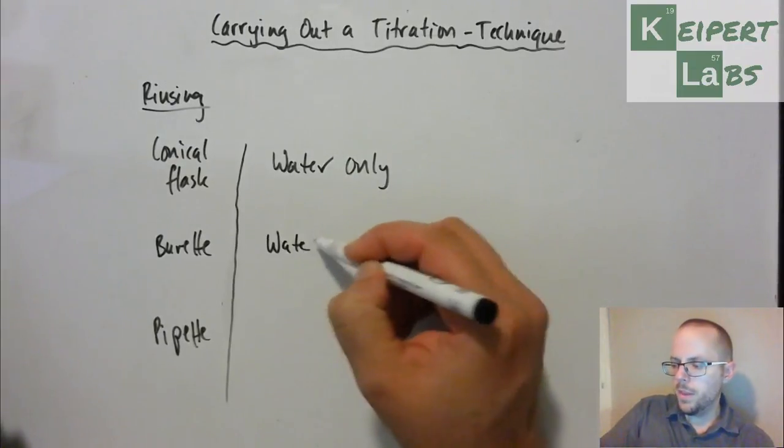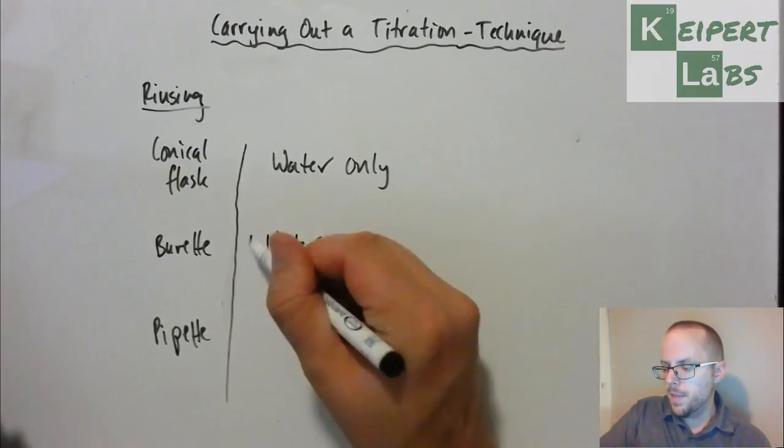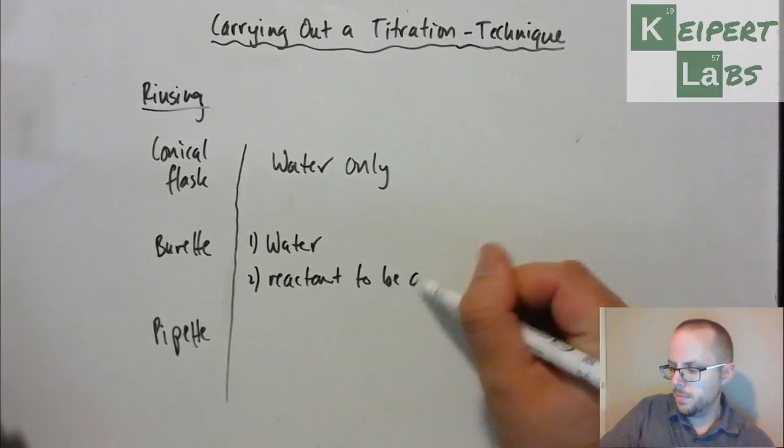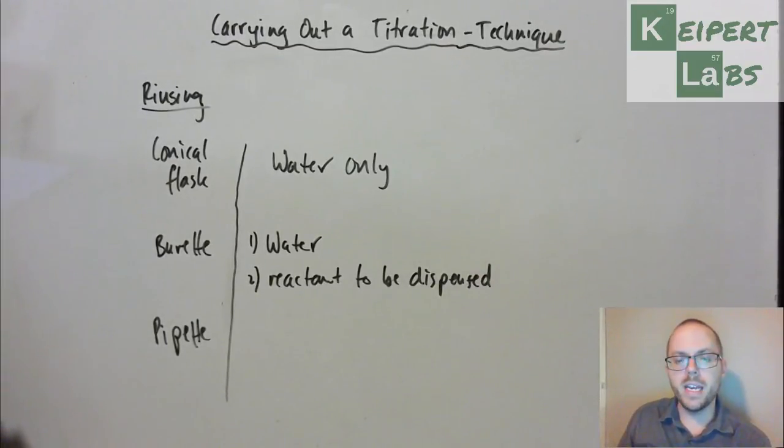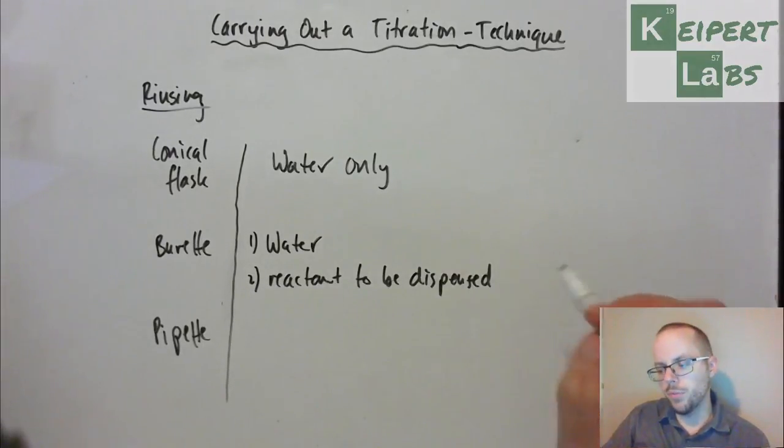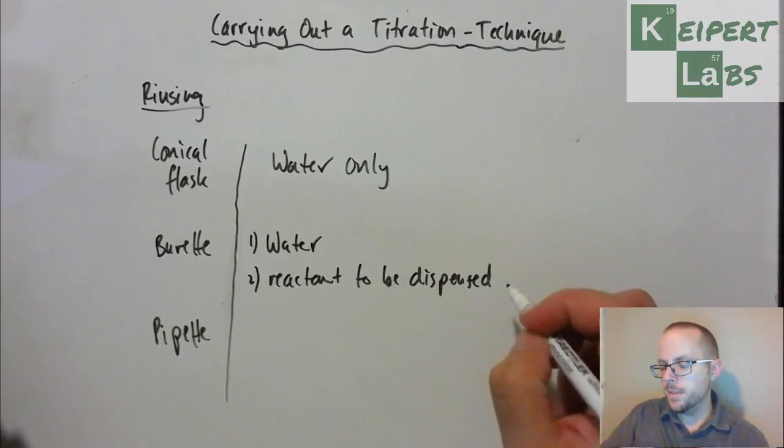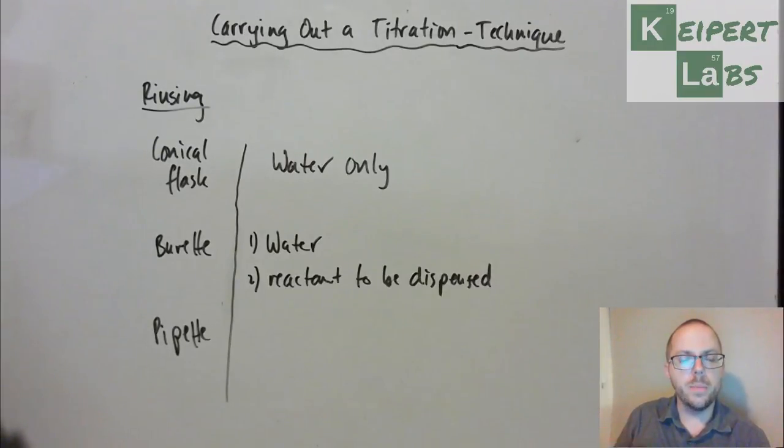So then, with a burette and then also with a pipette, we first rinse with water and then we second rinse with the reactant to be dispensed. So we get a small amount of water and we rinse our burette to rinse away any contaminants, and then we get a small amount of our reactant to be dispensed. We rinse our burette with it and then chuck it out. What happens is that it basically coats the inside of our burette with a thin layer of that reactant that's going to be added, so that we don't have any leftover water that's going to dilute the substance that we put in there.